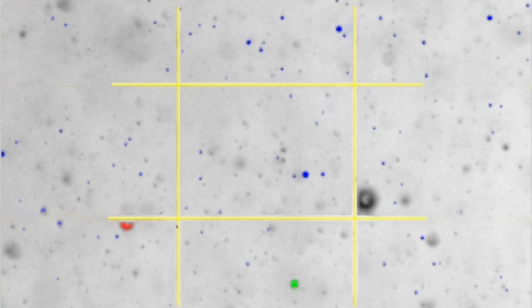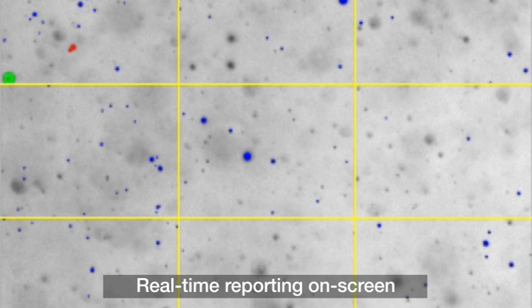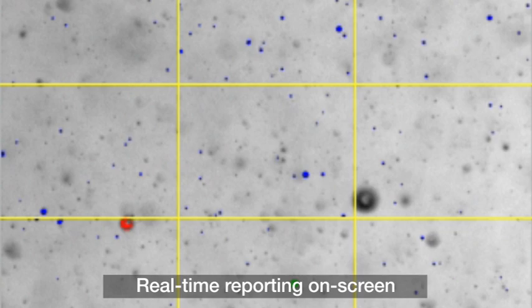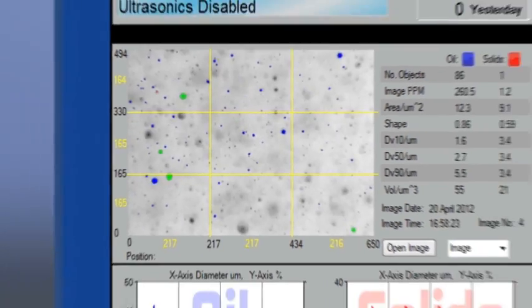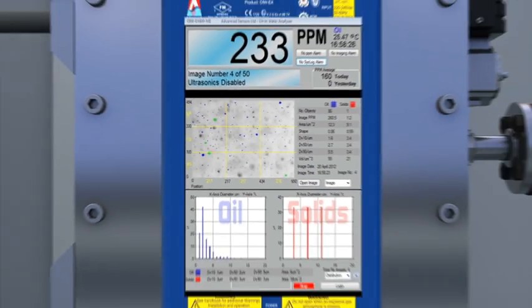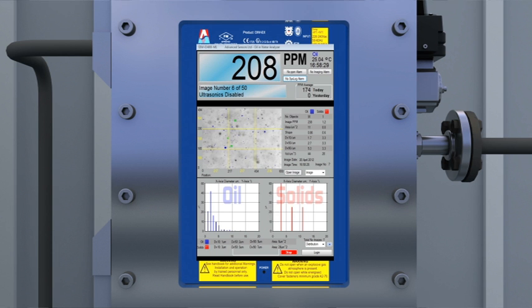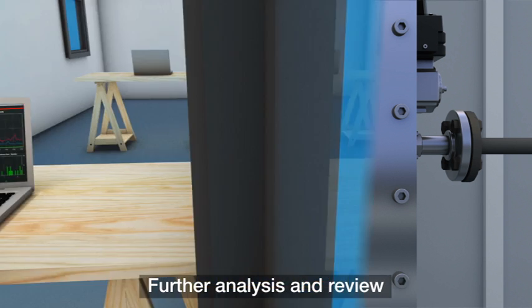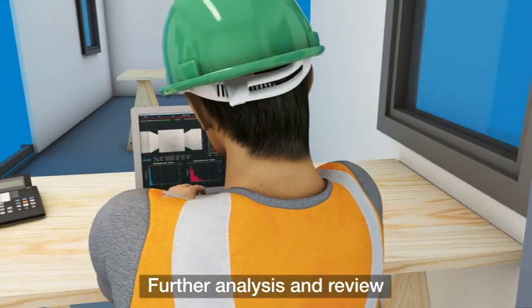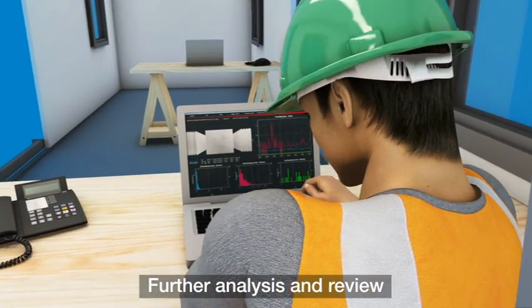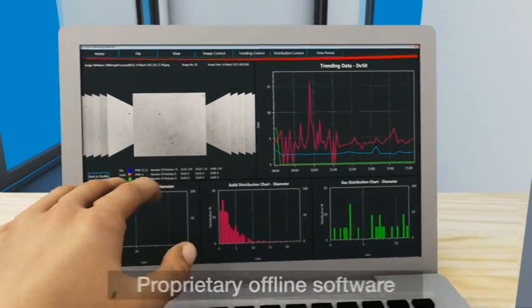As this process progresses, an accurate, detailed dataset builds and a clear picture of the water content becomes evident. All data is reported on the analyzer screen along with the fluorescent PPM measurement. Images are stored for further analysis or reprocessing.